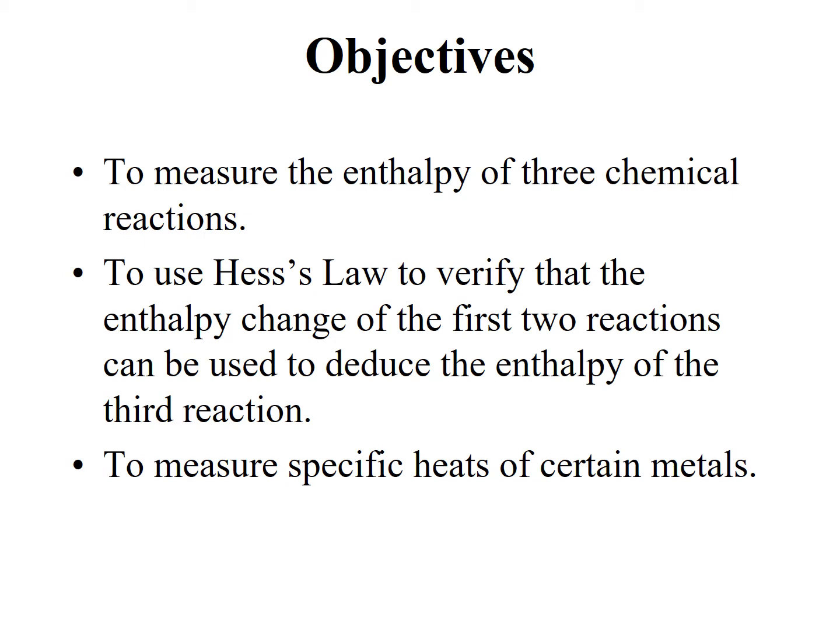The first one is to measure the enthalpy of three chemical reactions. To use Hess's law to verify that the enthalpy change of the first two reactions can be used to deduce the enthalpy of the third reaction, and then to measure specific heat of certain metals.